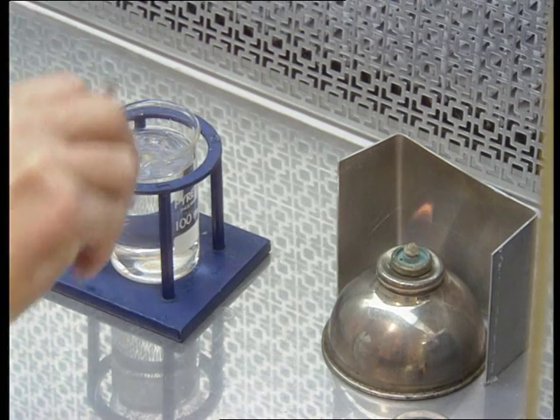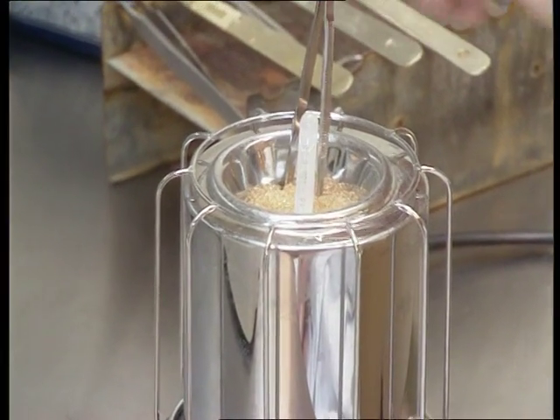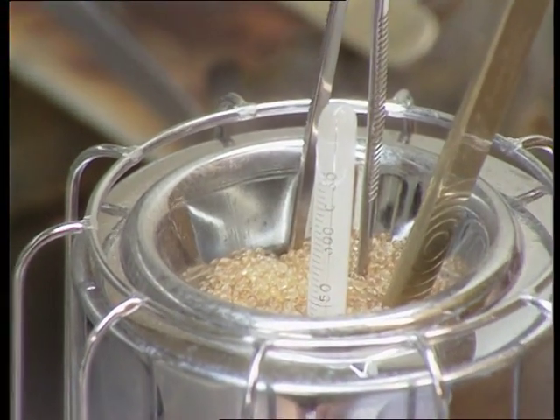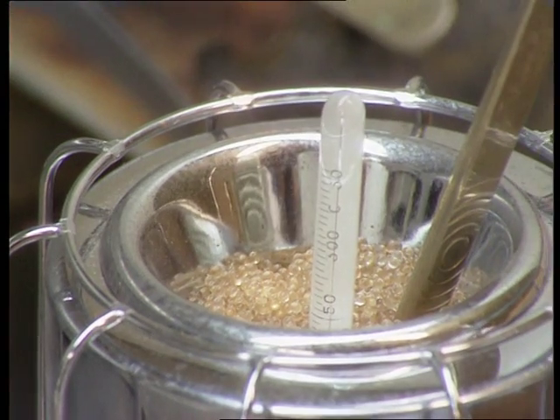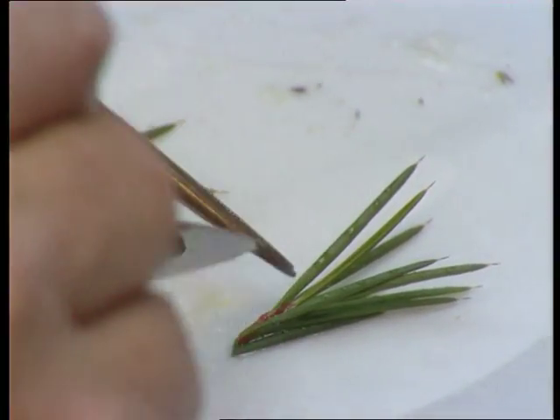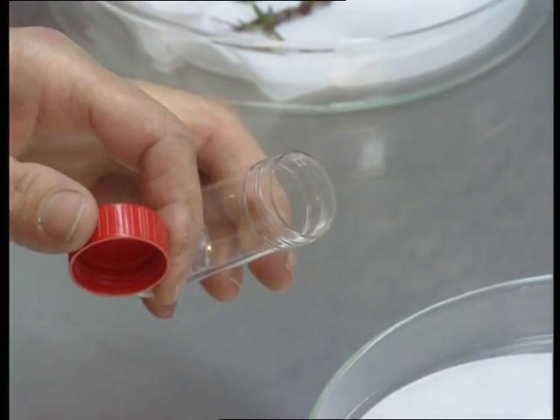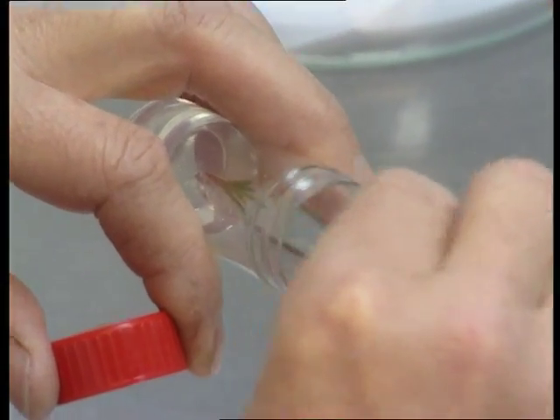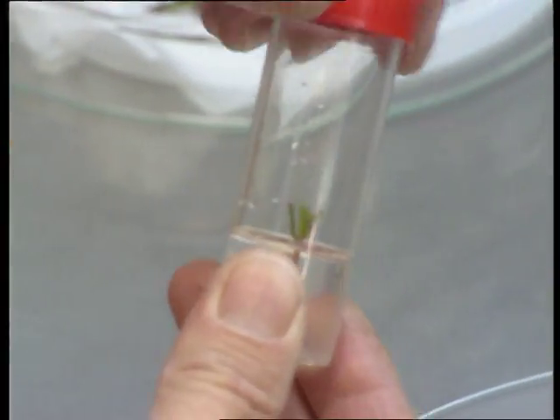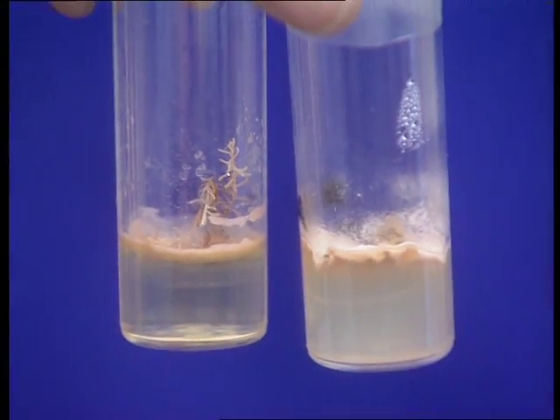There are other equipment used for this purpose, for example a bead incinerator. No matter what it is called or what you use, the objective is to kill any microorganisms which may have survived the process of surface sterilization of the plant material. At initiation stage, it is desirable to use small vessels and put only one explant into each vessel. The reason is that if you use larger vessels with more than one explant, and one of these explants becomes infested, you must discard the whole lot. Whereas in a small vessel, you contain the infestation to that one explant only.